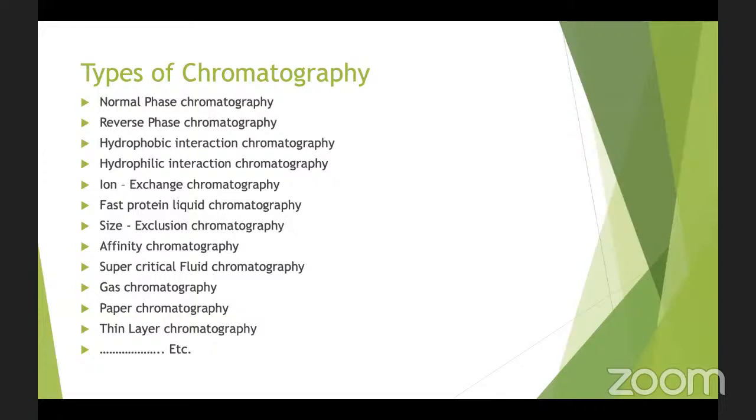So here the separation is based on the hydrophilicity of the component that has to be separated. Then ion exchange, as I said earlier, is basically separation on the basis of ion and how these ions are binding to the matrix. Matrix here is the stationary phase.